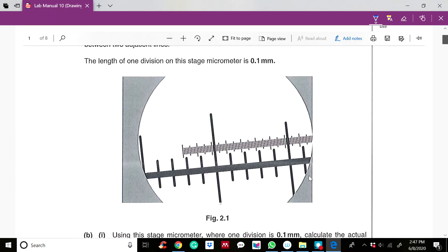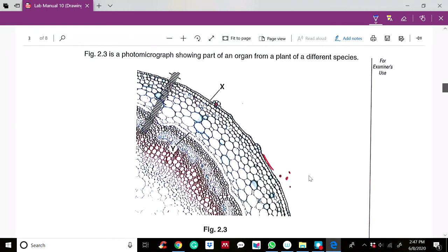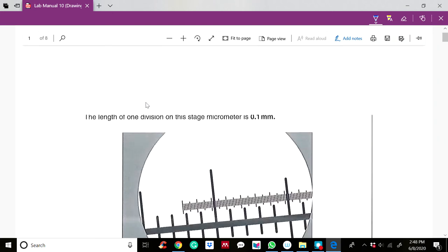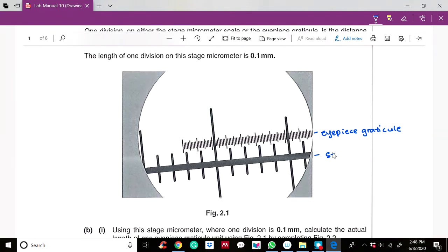Usually, stage micrometer divisions will be bigger than your eyepiece graticule divisions. You can also differentiate them by looking at the next diagram — the eyepiece graticule appears together with the specimen image. You can then label them: this is the eyepiece graticule, and this is the stage micrometer.